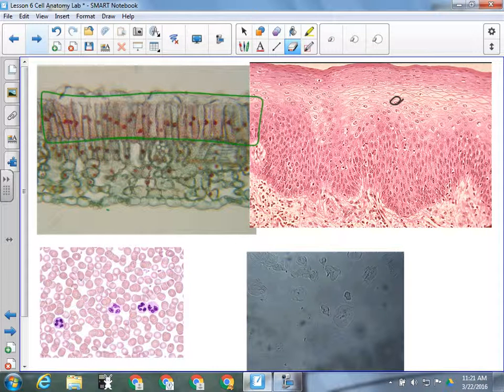And once you get them blown up, I mean, you can see a fair amount of stuff. You can see there's some stuff in the corner of this cell here. Okay, you can see that there's some structures that seem like they're attached to the nucleus. I'm not saying use your imagination, but use your imagination a little bit. There's no other really way to say that. You have to look at it and kind of be objective and go, okay, there's usually this around there, so that's probably what that is. Be logical about it. Carly, question?